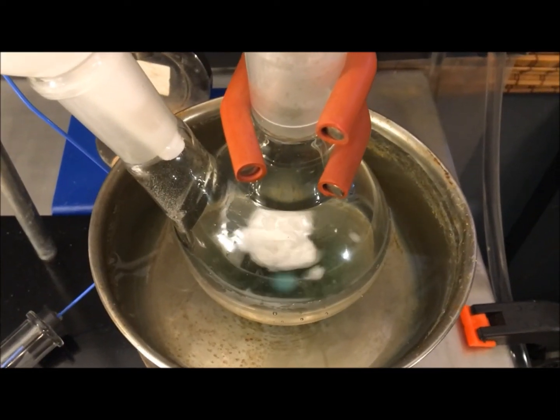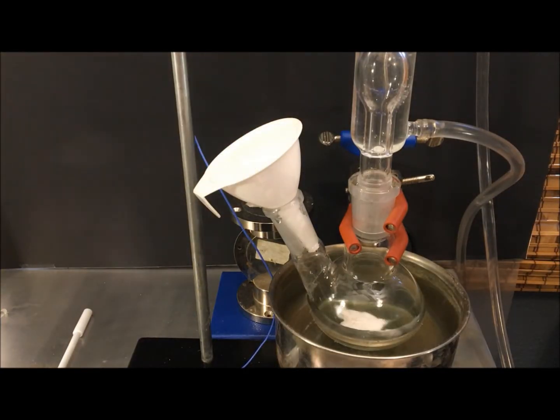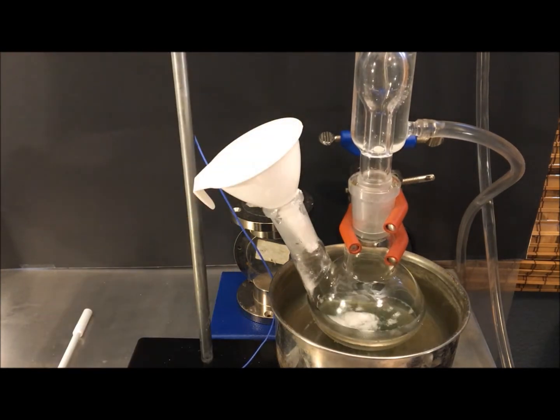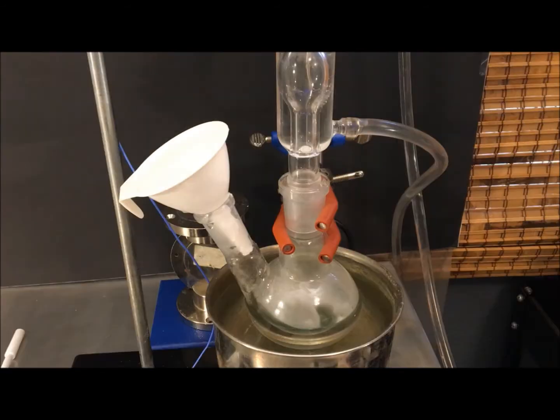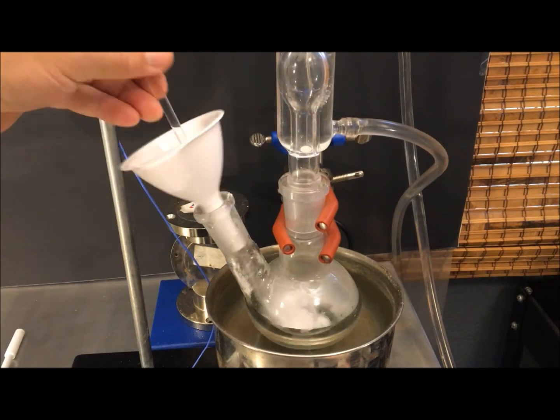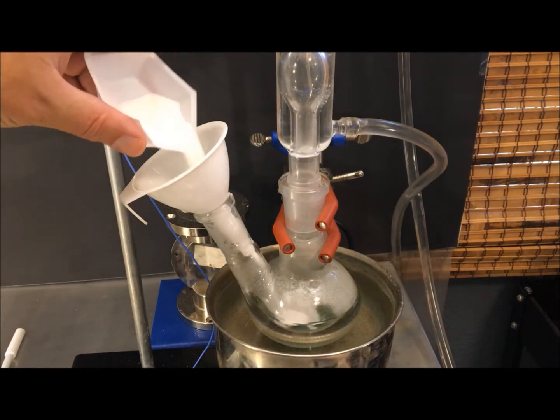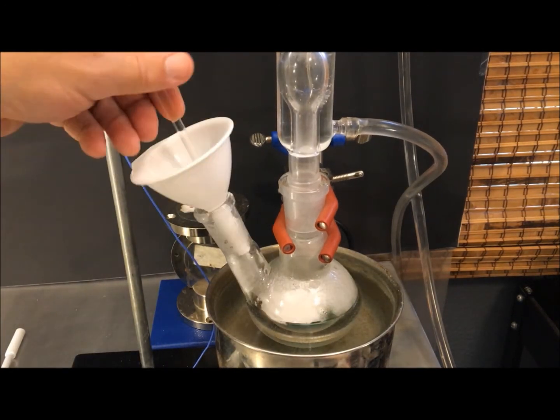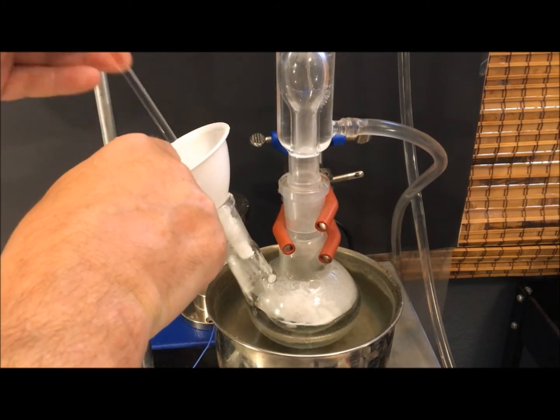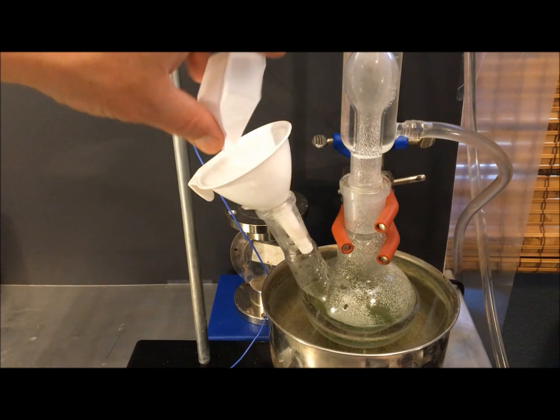Now, if you thought the copper sulfate was bad, this stuff is like a nightmare. It dissolves extremely slowly. It forms like this giant glob that I wound up having to fight with a stick for about an hour. So it's actually best to do this in a separate beaker beforehand. You could heat it up a little bit and not have to pull your hair out. Also add it in small amounts, otherwise the glob gets big and dissolves even slower. It will eventually dissolve though. And then the last thing you'll want to do is add the ascorbic acid.